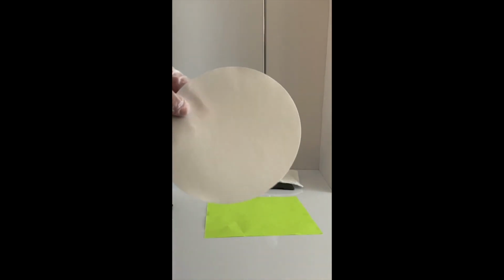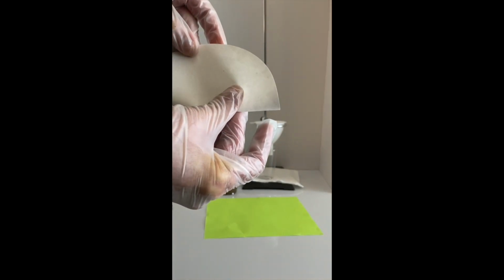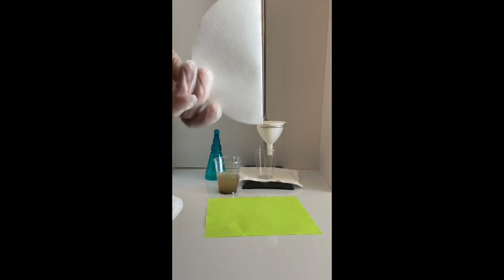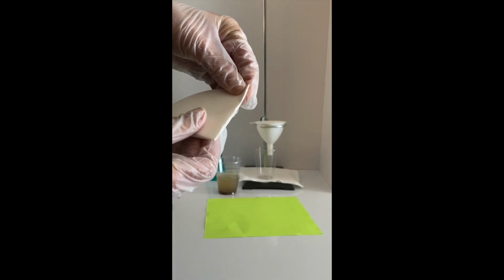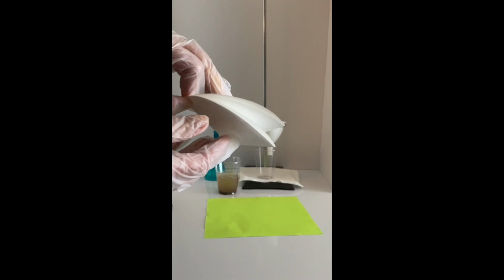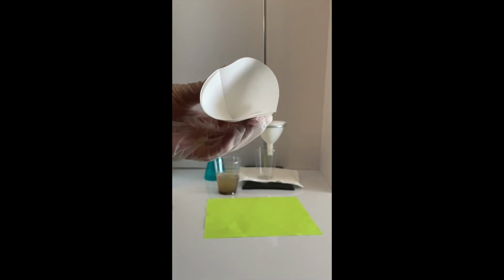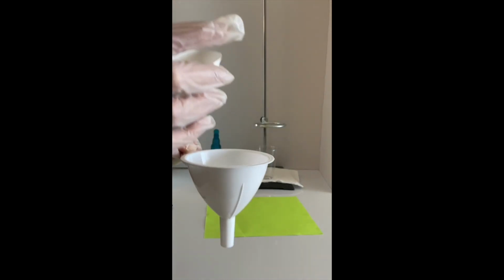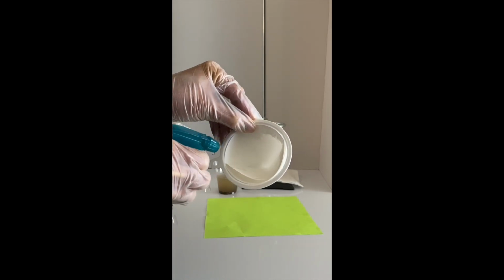Now it's time to fold the filter paper to put it in the filter funnel. First, we fold the circular filter paper in half, forming a half circle or a semicircle. Next, we fold it in quarter, forming a quarter circle. Then we'll count 3 flaps, 1, 2, 3, and open the filter paper into a cone. The cone-shaped filter paper is placed in the filter funnel and moistened with water. This allows the filter paper to stick to the sides of the filter funnel.